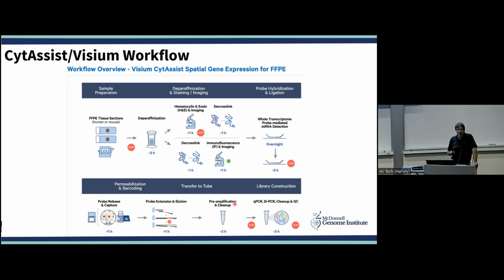We haven't really done enough testing to tell you whether this is more like FACSeq or more like a 10X Chromium type run in terms of the limitations of the numbers of transcripts you can detect per cell. We haven't done a deep sequencing run yet on Visium. We were waiting for Visium HD for that. But depending on how deeply you sequence, that can be a more expensive component of this.